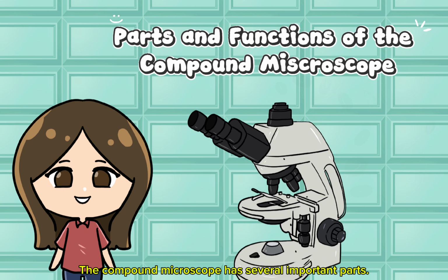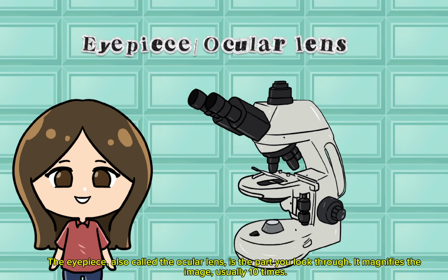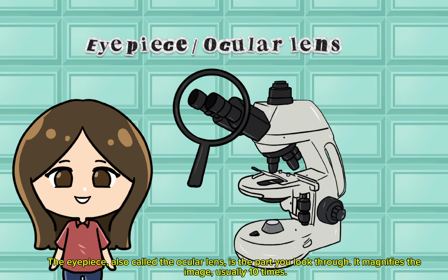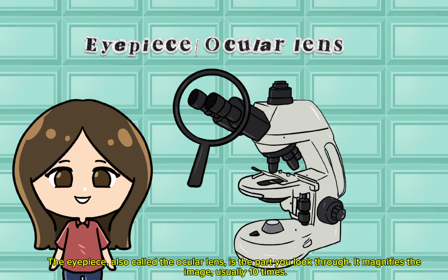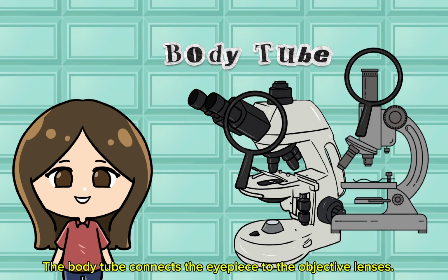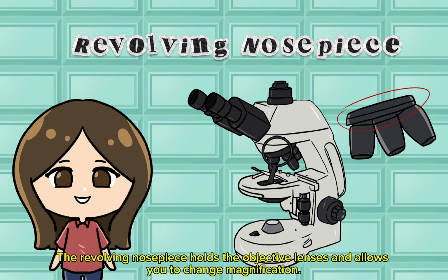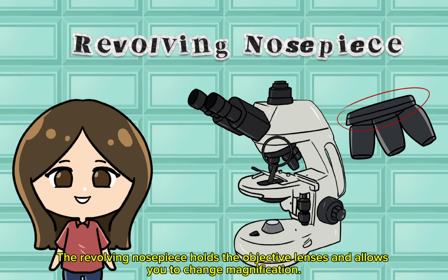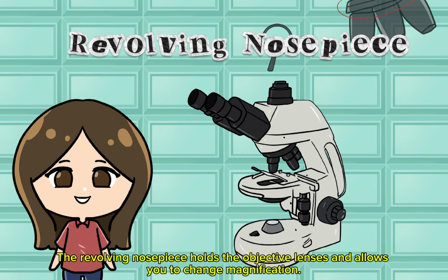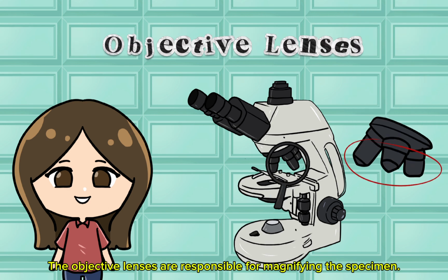The compound microscope has several important parts. The eyepiece, also called the ocular lens, is the part you look through. It magnifies the image usually 10 times. The body tube connects the eyepiece to the objective lenses. The revolving nosepiece holds the objective lenses and allows you to change magnification. The objective lenses are responsible for magnifying the specimen.